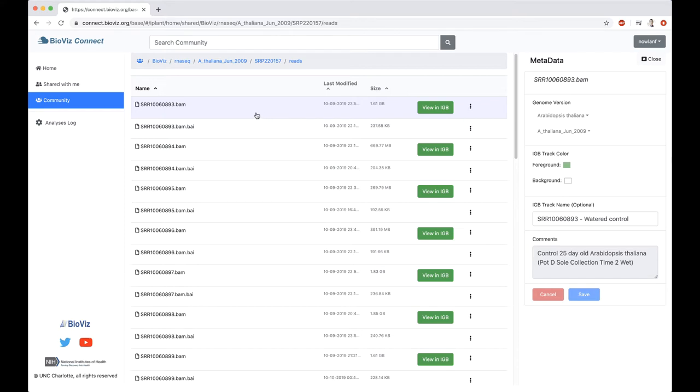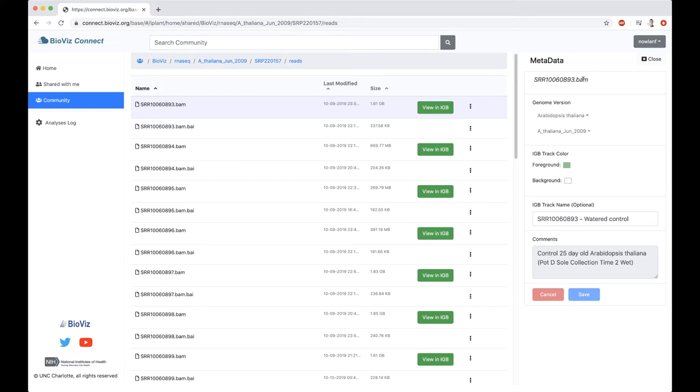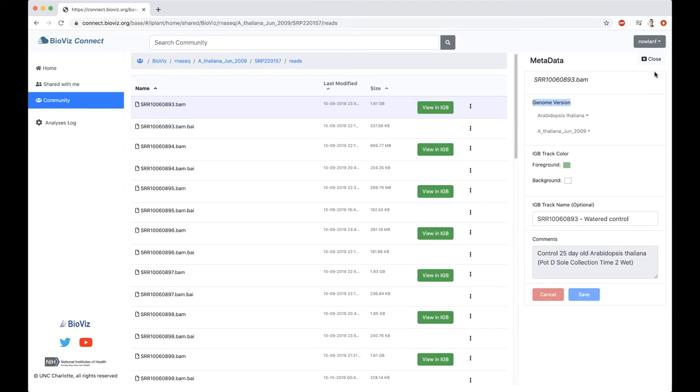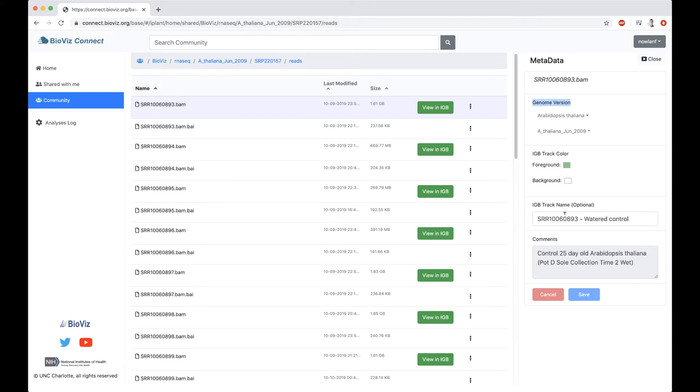To get more information about these files, you can right-click or click on this three-dot button here and click metadata. All files and folders within BioViz Connect can have metadata associated with them. Adding or editing metadata requires owning that file. In this case, this is a public file. We have read access, so we can see the metadata, but we can't make any edits. But someone has gone through and added metadata for this file.